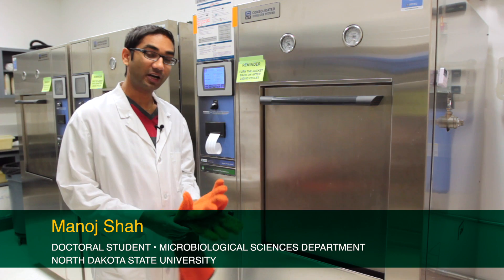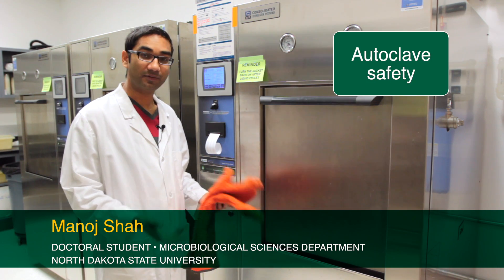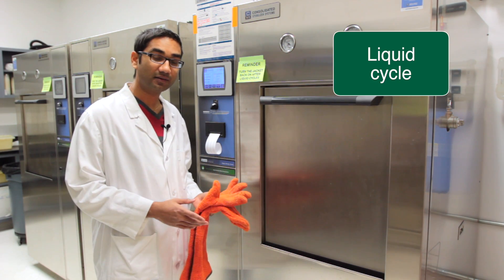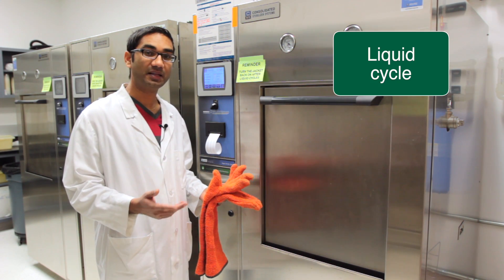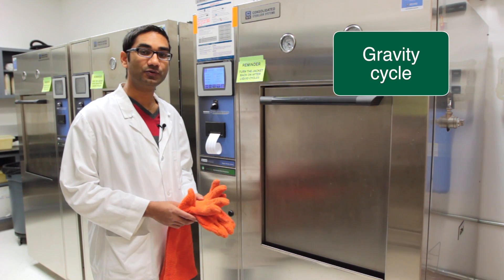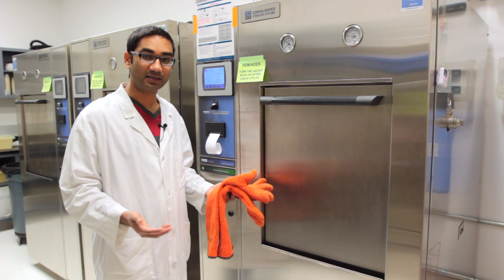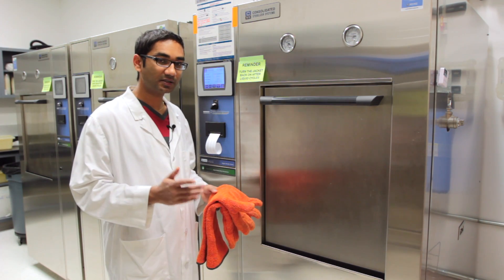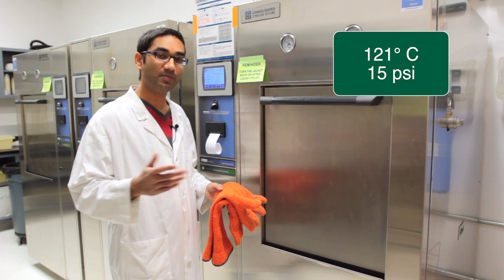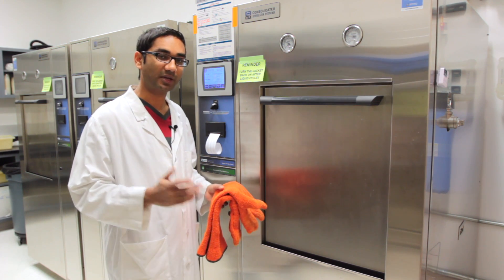Hi, today I'm going to be talking about how to operate an autoclave safely. There are two main cycles we can use in an autoclave. One of them is the liquid cycle, used for media and mainly liquid stuff, whereas the other is the gravity cycle, which we use to decontaminate our trash and biohazard bags. The conditions are 121 degrees Celsius, 15 psi, and 15 minutes; however, the length of time can be changed.